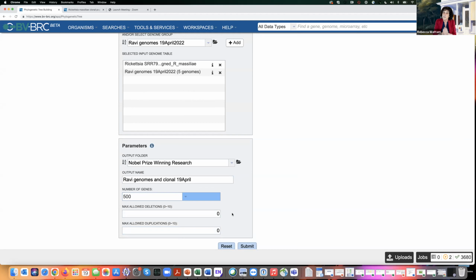This service, called the codon tree pipeline, looks for what we call perfect protein families. In this instance, it means a protein family that has one gene for each genome selected. So in each protein family, if there are 6 genomes here, it would have 6 representatives, 1 from each genome. Those are the perfect families.